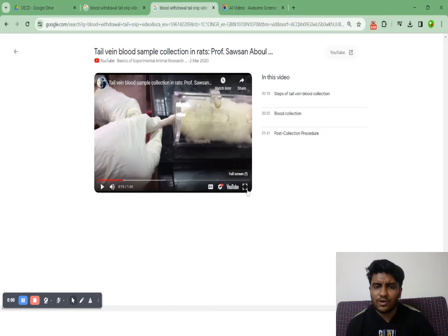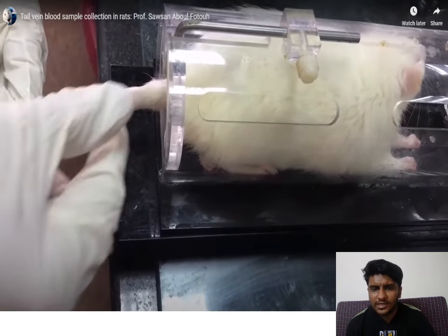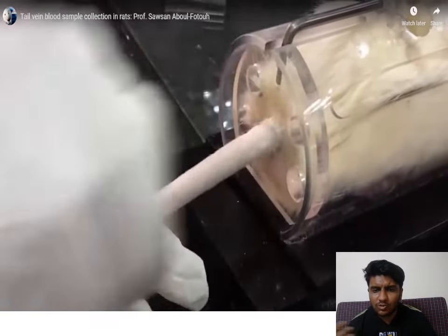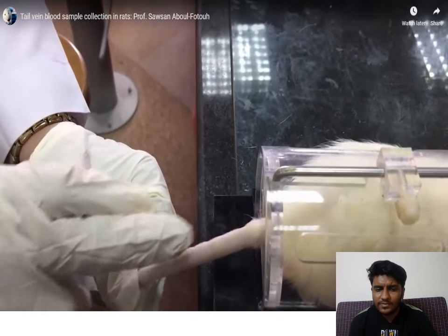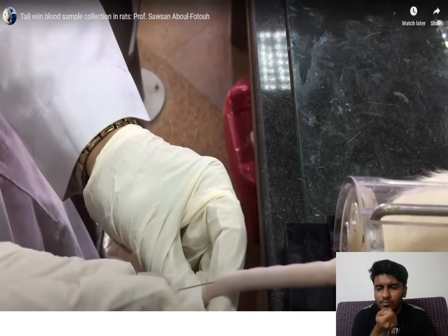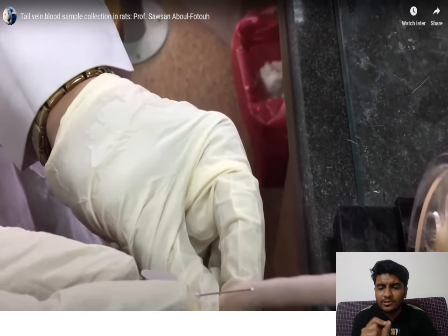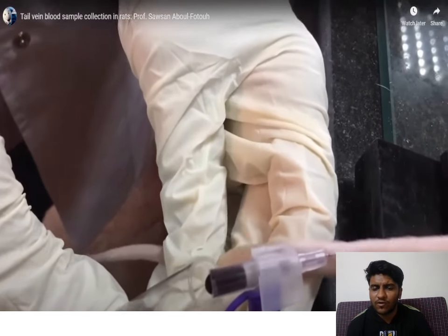This video demonstrates how to restrain an animal and collect blood from a rat or mouse. The rat is placed inside a restrainer. The tail is washed with ethanol and then massaged — massaging causes congestion of the veins so they appear superficially. From 2 to 3 centimeters from the tip, gently press to cause congestion. Insert a cannula connected to a tube containing anticoagulants like EDTA to prevent blood clotting.